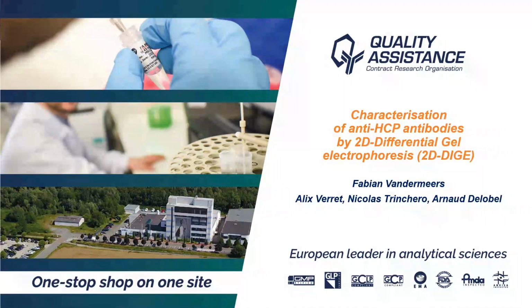Today I'm going to present data on the characterization of anti-HCP antibodies by 2D differential gel electrophoresis and especially on the implementation of the Melanie Coverage software.